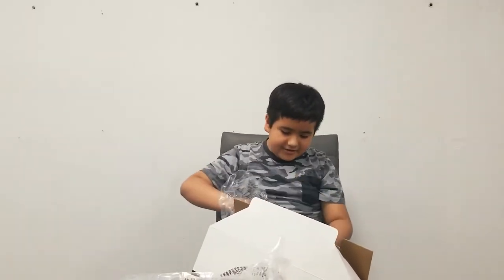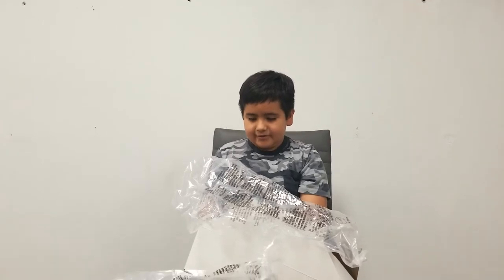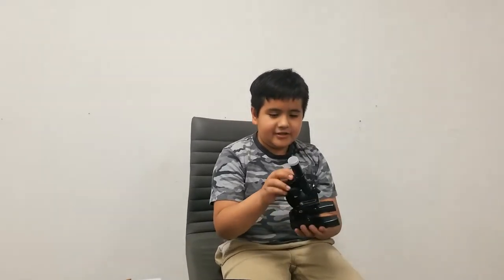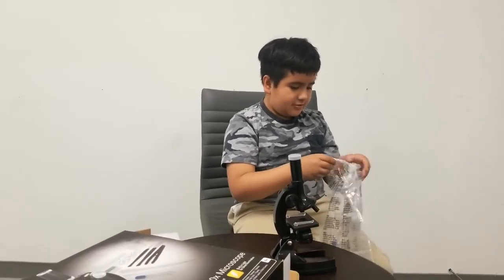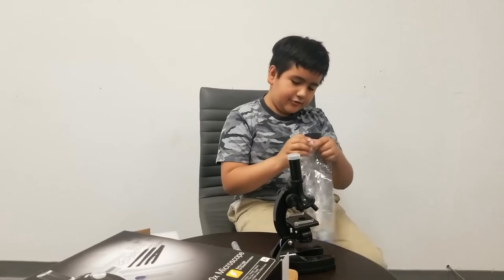Okay, so this appears to be like the actual microscope — I'm just gonna take this off. It has a room — this is the actual microscope, and this looks like a little light thingy, and this is to adjust it. I'm just gonna put that aside and actually take the stuff out of this bag from earlier, so we got this thing and this little container thing.